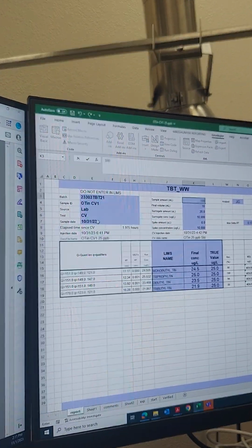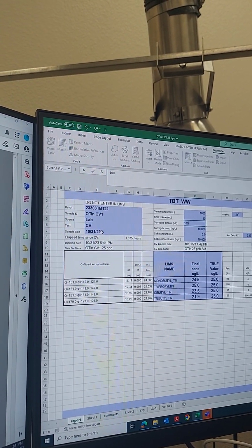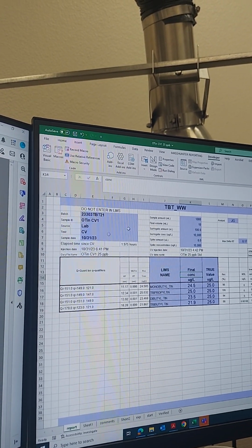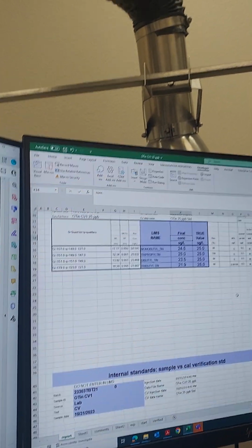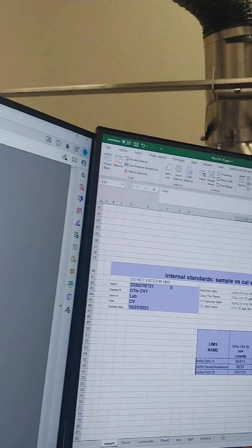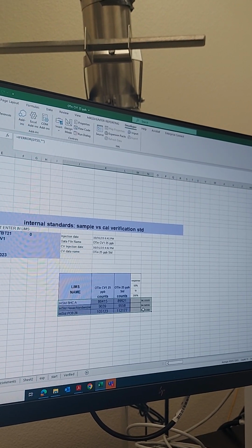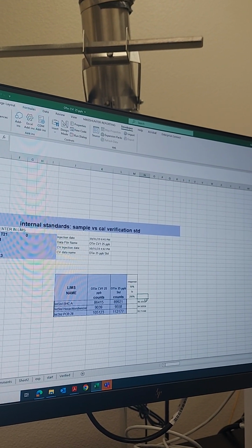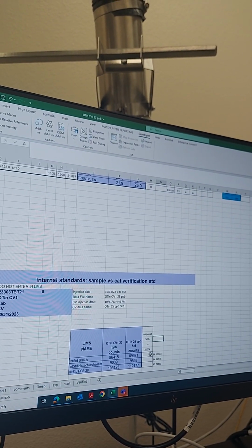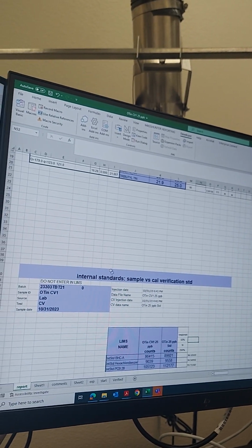Okay, what else? This should say 1,000. 10, 10, 10. This should say 100. 0, 10. Okay. And, yeah, all the recoveries are good. And this, it's okay. Looks good. Okay. And then, do you have internal standards? What, like in your analyses? Yeah, the internal standard, the 10 microliters that I add at the end, or what? No, like in previous... use one.